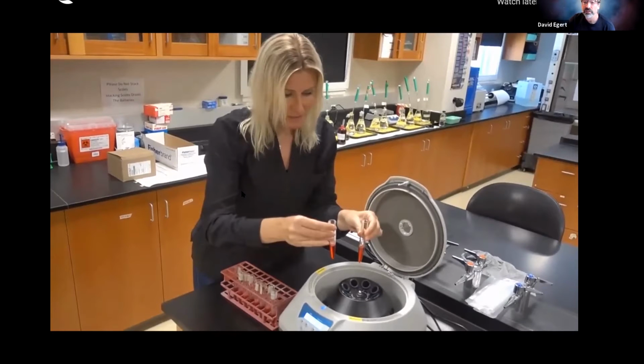So it's good to do double checks. Before you put them in, they should all be the same height. Every once in a while they're not, in which case you're like, oh, I'm glad I checked. That's another thing about this lab: realizing it's okay not to be perfect, and that's why you need to double check yourself on things.